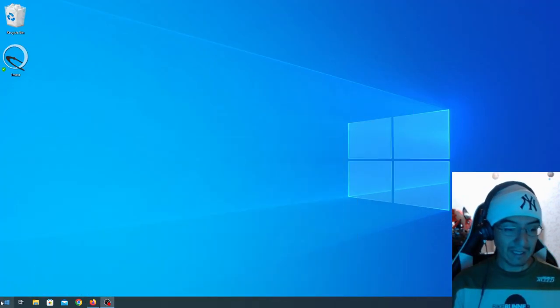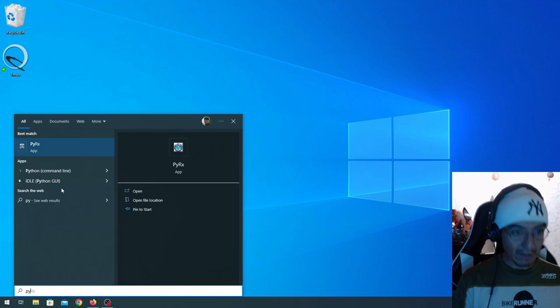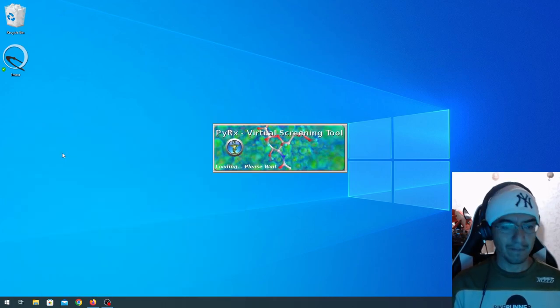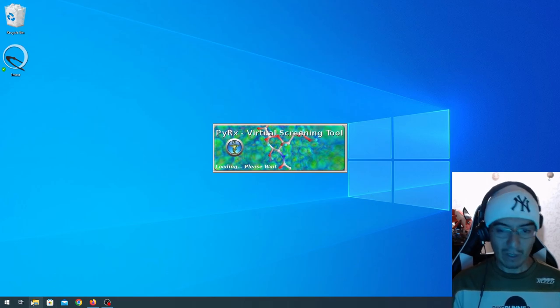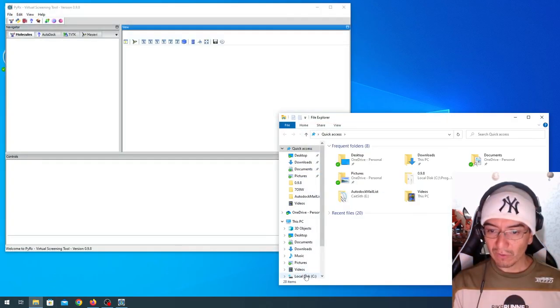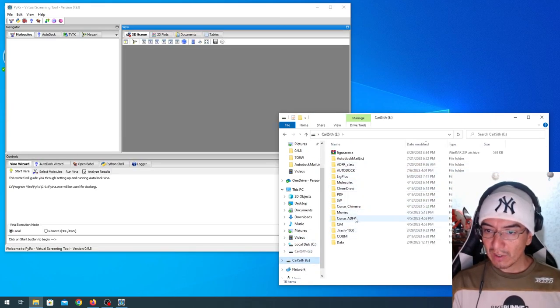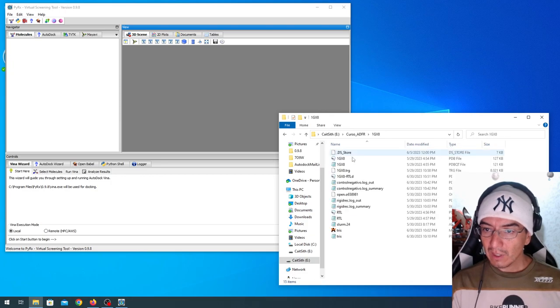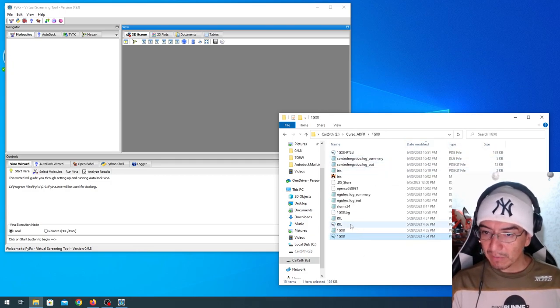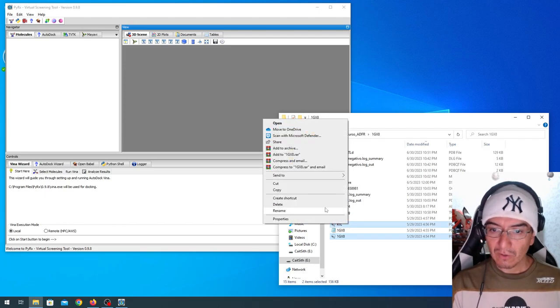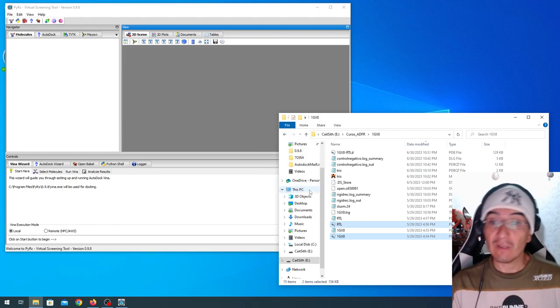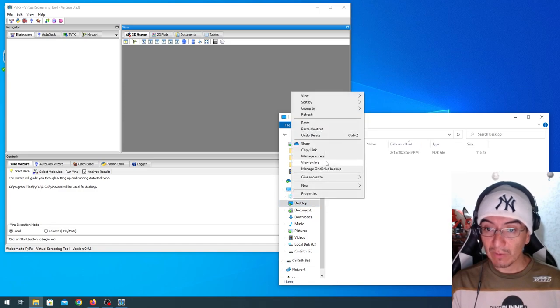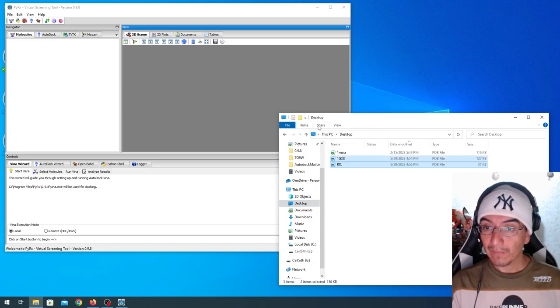With that installed, PyRx should look kind of like this. I'm going to move a couple of files to the desktop so we can run the docking. These files I'm going to use are just the PDBs for the receptor and the ligand. I'm just going to copy them. This came straight from the PDB database, nothing fancy about them.